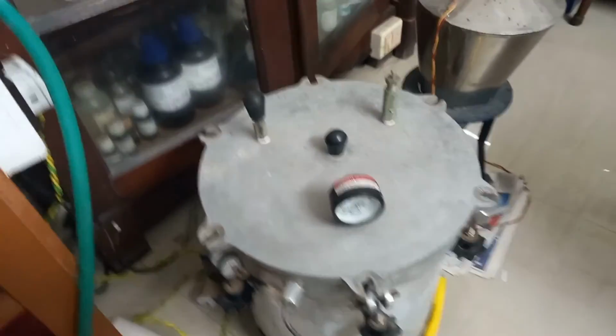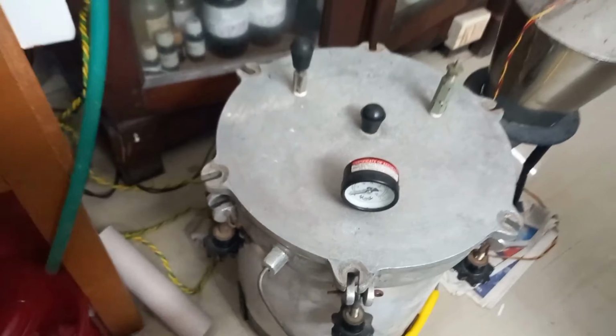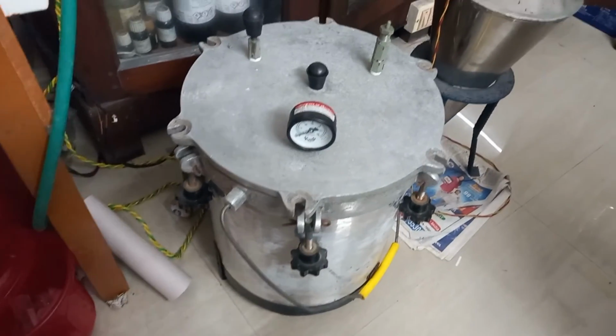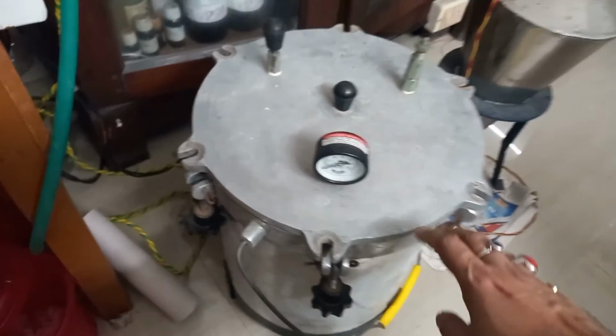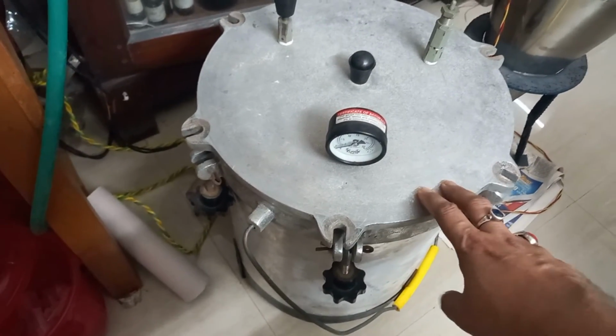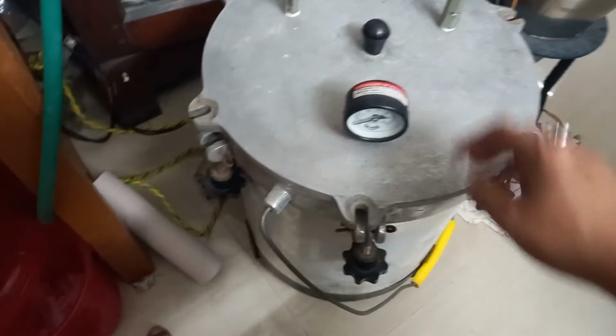So friends, this is our autoclave. As you can see, this is made up of stainless steel, and this is the meter which I was talking about. This is the cover of the autoclave, and this is the chamber of the autoclave. All things are kept in this chamber, and this is the cover.